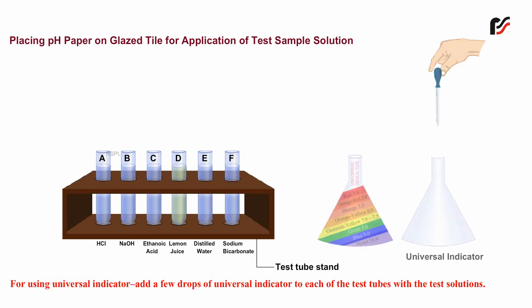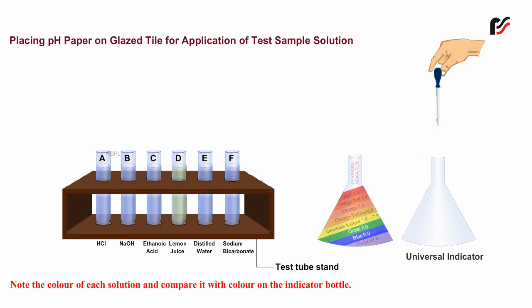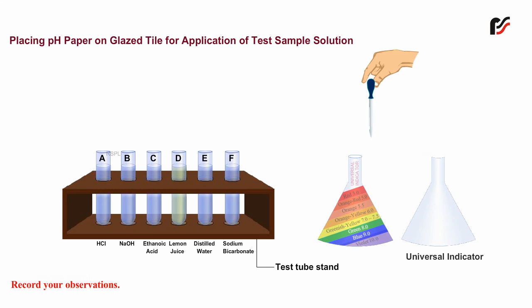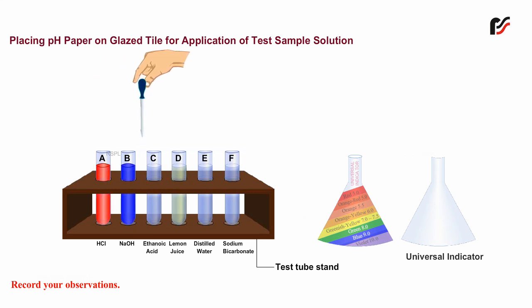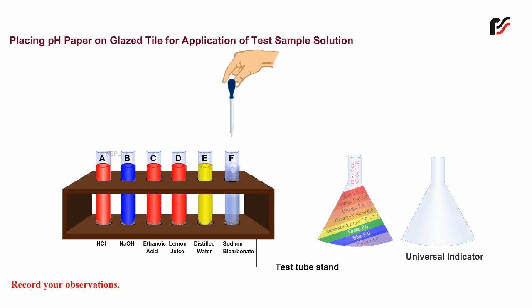For using universal indicator, add a few drops of universal indicator to each of the test tubes with the test solutions. Note the color of each solution and compare it with the color on the indicator bottle, then record your observations. Adding universal indicator to each of the above solutions gives the same result as with the pH paper. Note that the color and pH values may vary depending upon the concentration of the solution.